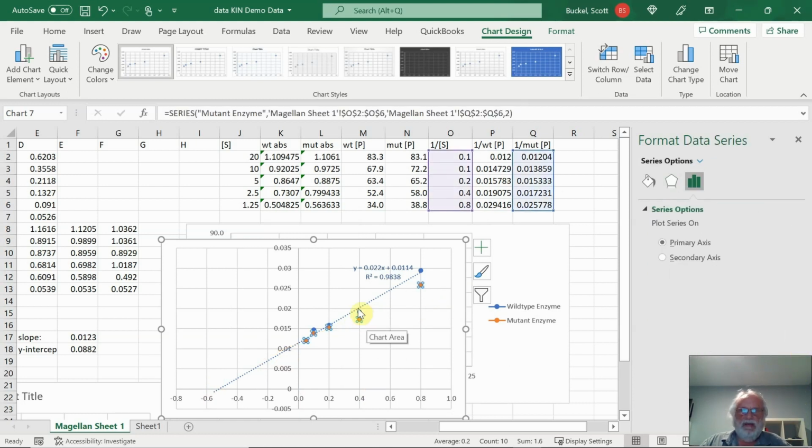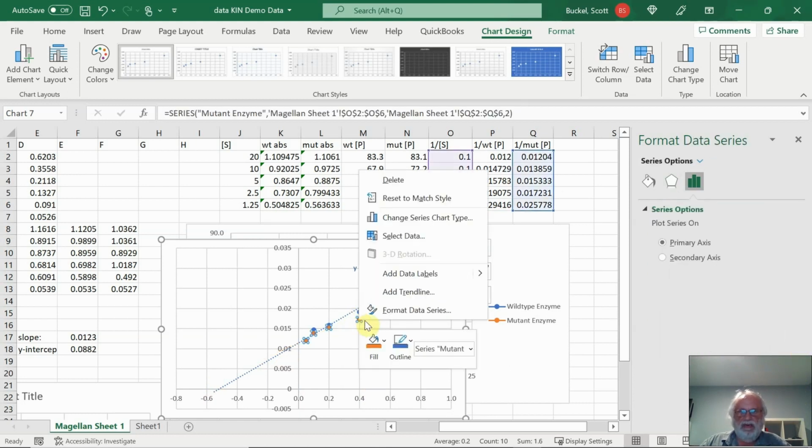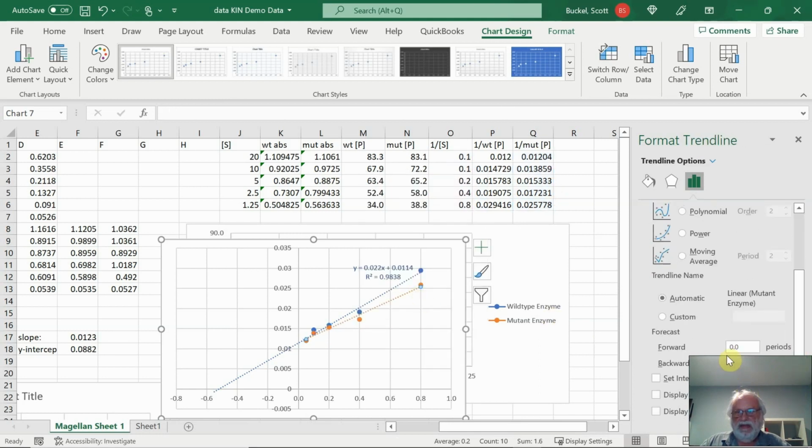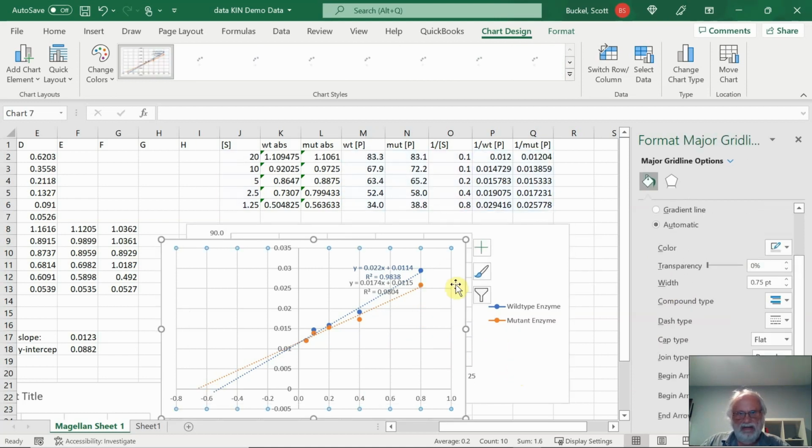Okay. Now what I'll do here is I'll right click on it, add trend line. That goes to, I think, probably about 7, not 0.7. Display equation on chart, R square. Looks like it's hitting the line. It looks good. So let's click on the chart here, accept all that. And here the equation is there.